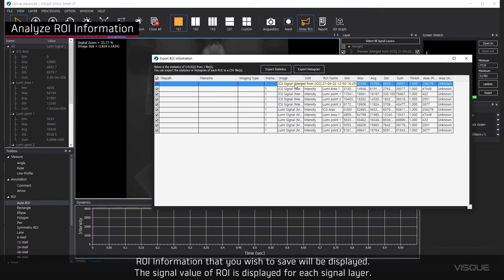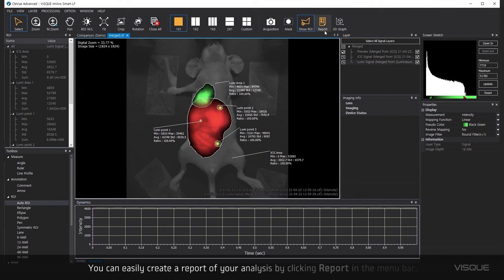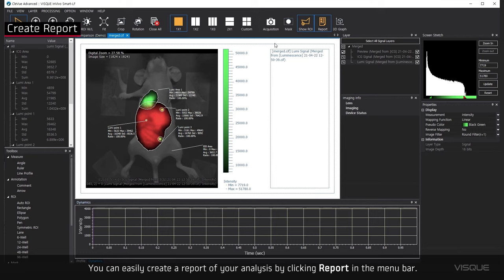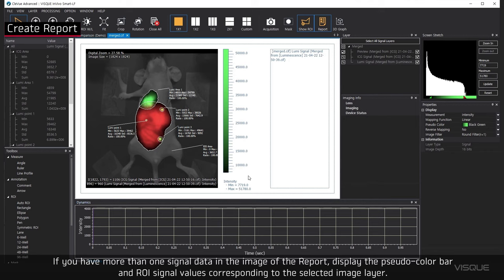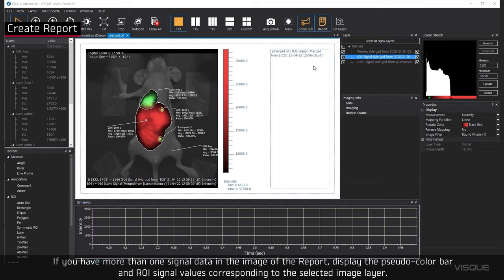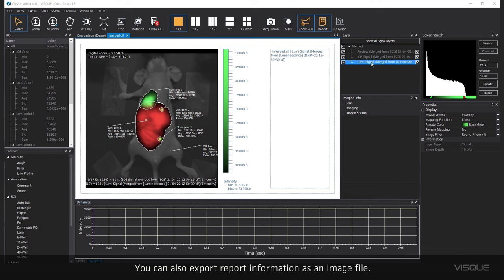You can easily create a report of your analysis by clicking Report in the menu bar. If you have more than one signal data in the image of the report, display the pseudo color bar and ROI signal values corresponding to the selected image layer. You can also export report information as an image file.